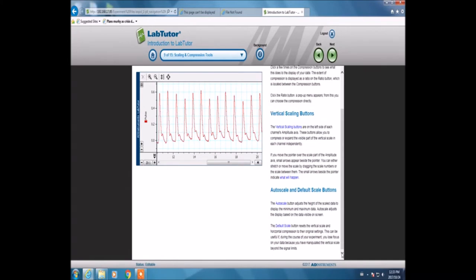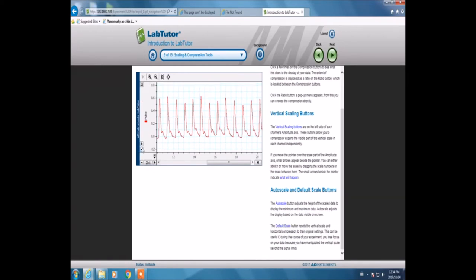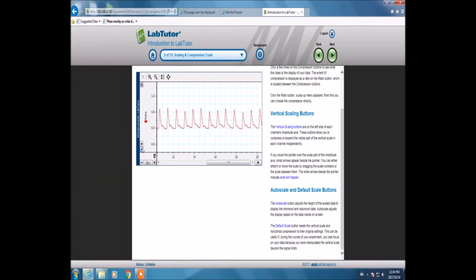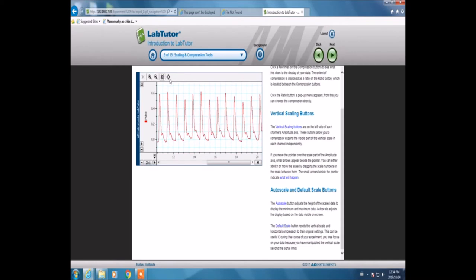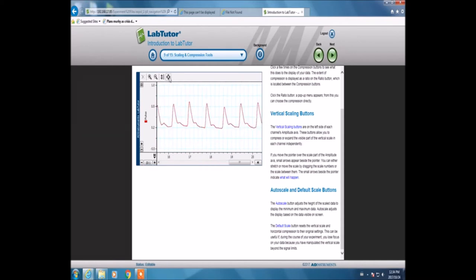Now we're going to vertical scaling. I'm decreasing the scale over here. This is set default scale, auto scale, set default scale again.